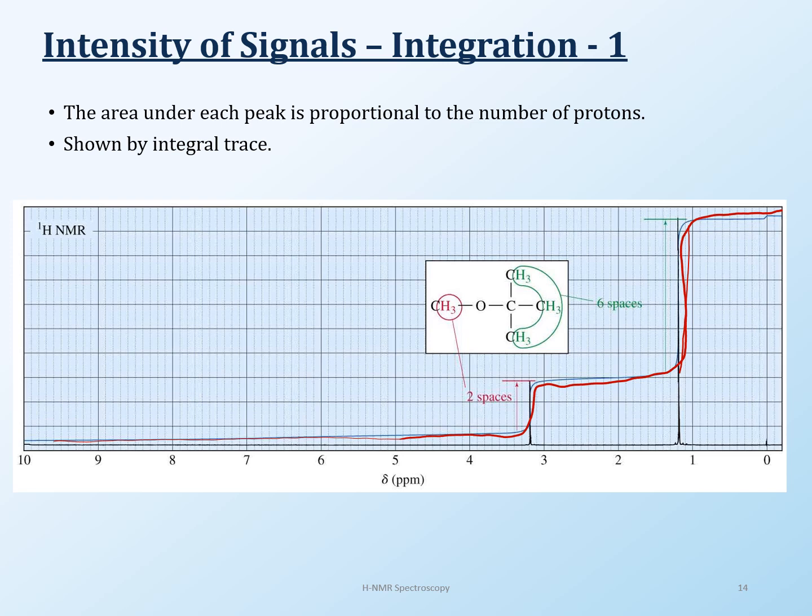Okay, so I'm going to erase it now. Now that you've seen it, once you get that line, you sit on the computer and decide where to chop. I want to chop right here, as close to the peak as possible, because then the computer is going to calculate the area under the peak right here. If you chop here and here, it's going to calculate the area under the peak here, so you might get some other stuff which you don't need. So you want to make sure you chop really close to the peak. You chop here, and right here and here. Once you cut it, the computer is going to calculate.